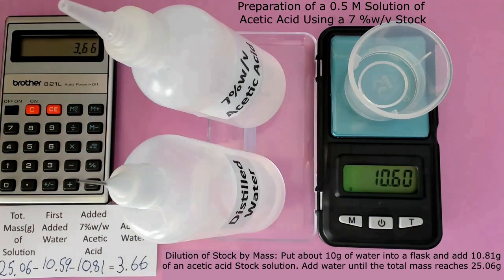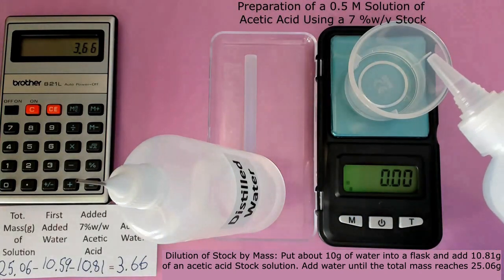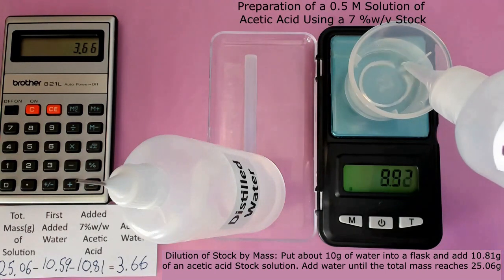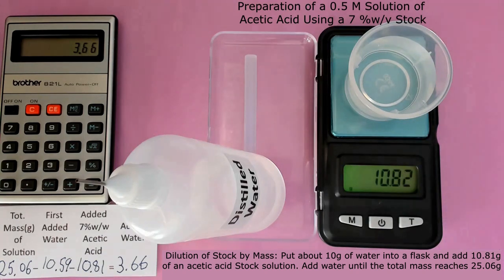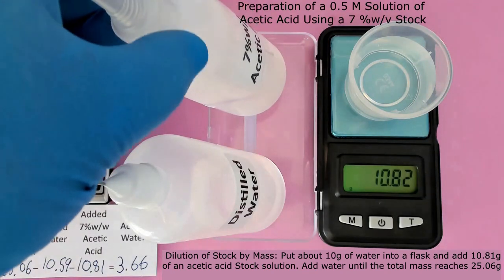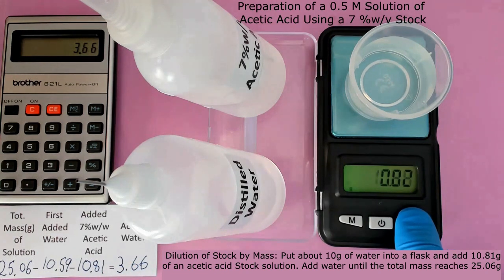Press the tare button to reset the display to 0. Next, add 10.8128 grams of acetic acid stock solution. Add the calculated final amount of water to the cup. This will bring the total mass of the solution to the target value. Press the tare button to reset the display to 0.